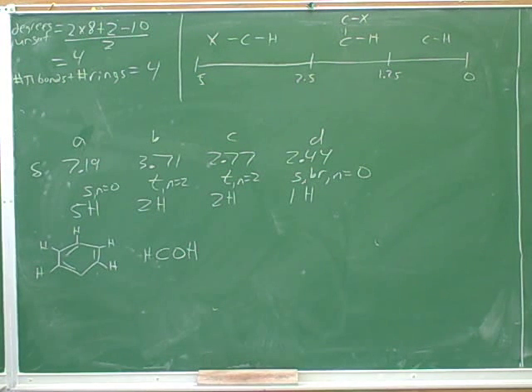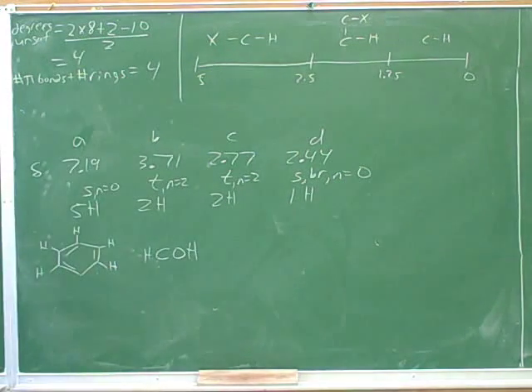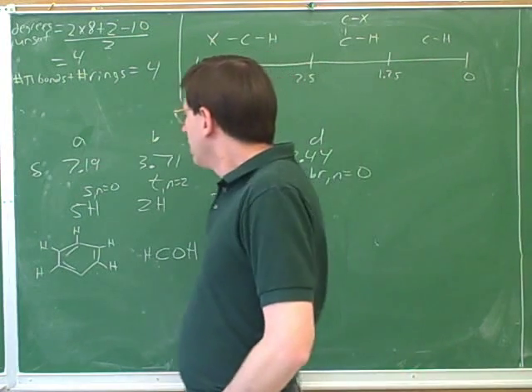Then I think I might have it now. A, B, C, D. Excellent, okay. Thank you for the clarification. That was the one clue I was missing, remembering that alcohols don't split. Right. And that would be consistent with D. Good. Yeah, very good.